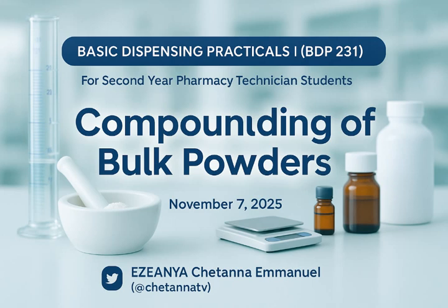You take the same 10 grams from here and add here, right? Yes. And keep mixing. When they mix properly, what do you have left here? 20. You take 20 grams from here and add here and keep mixing. When they mix properly, what will remain? What will be inside?